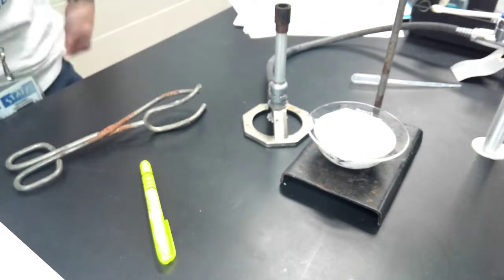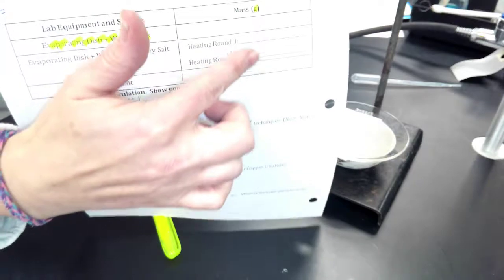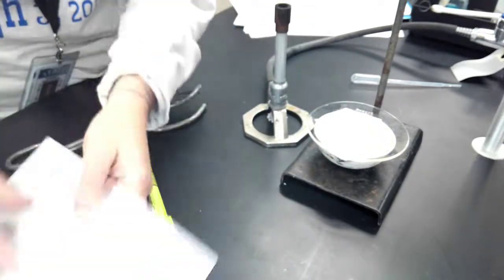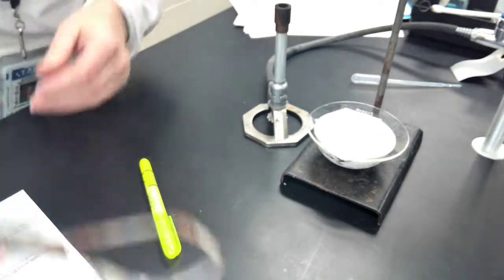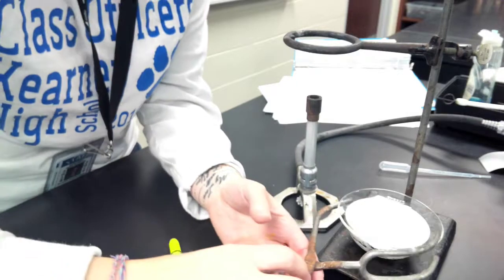After I have massed it, I'm going to record that mass in my data table. It says heating round 1. Boom, right there. Heating round 1. Record the mass of my system. Right? Then I'm going to put it back onto my Bunsen burner and I'm going to do this round 2 style. So I'm going to pick it up gently.